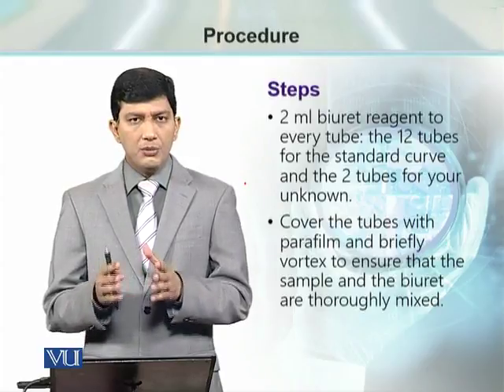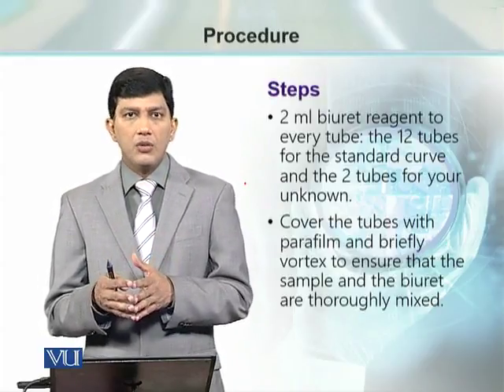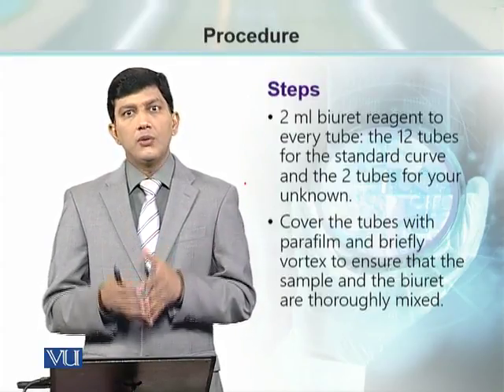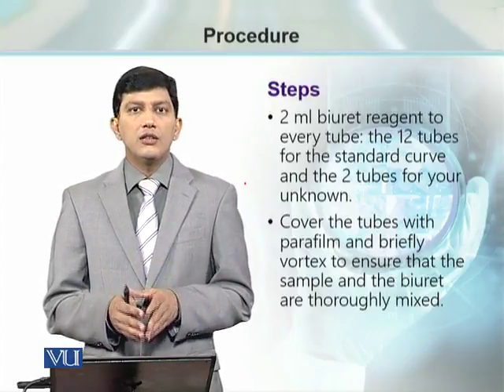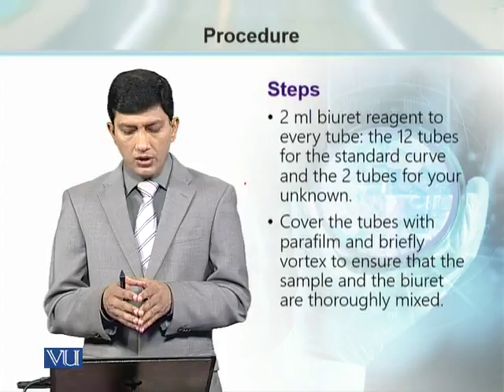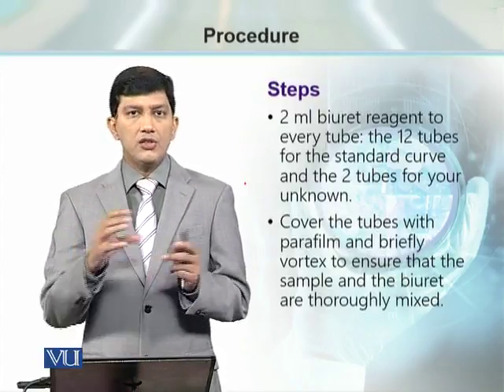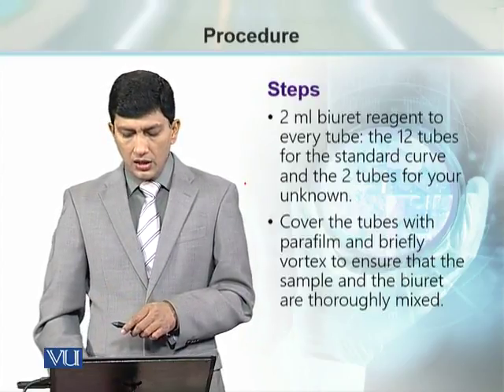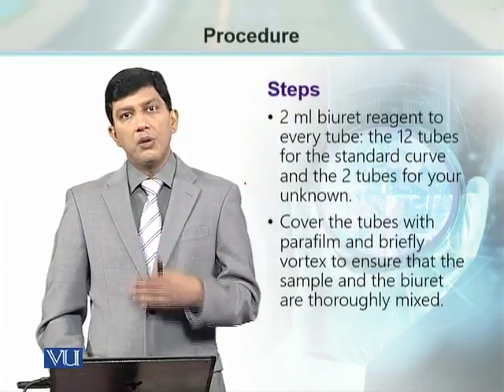मैं यहाँ पे एक दफ़ा फिर बताता चलूँ, ये 2 ml volume adjustable है. It can be increased up to 10 milliliter depending upon our initial volume of the sample. So in this case, we are going to add 2 milliliter of the biuret reagent, and then we have to mix the biuret reagent and our sample so that the reagent and the sample can easily be mixed up.